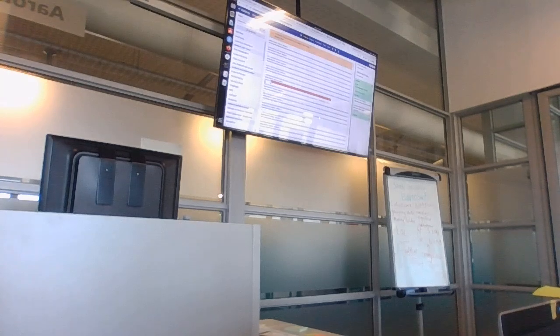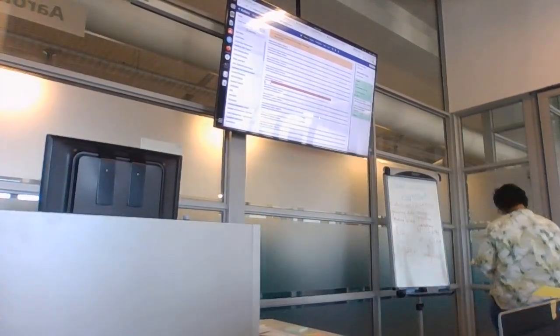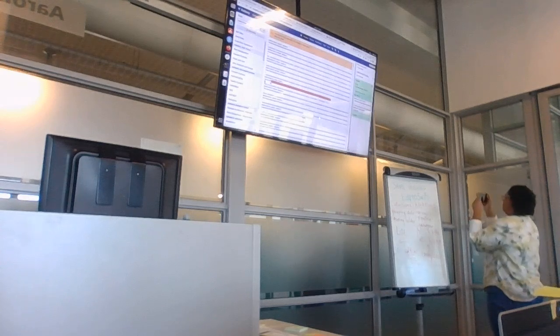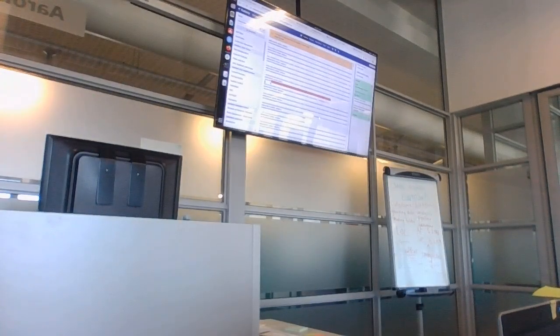I've got 10 million reads. They span almost my whole arm. I'm taking all of those reads. They're going forward now. The difference between the forward and the reverse is only, most of the time, that they don't overlap 100% completely the same read, but they will overlap most. And in fact, you have bad reads.